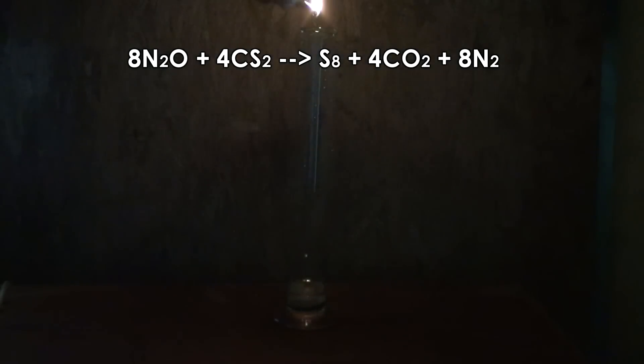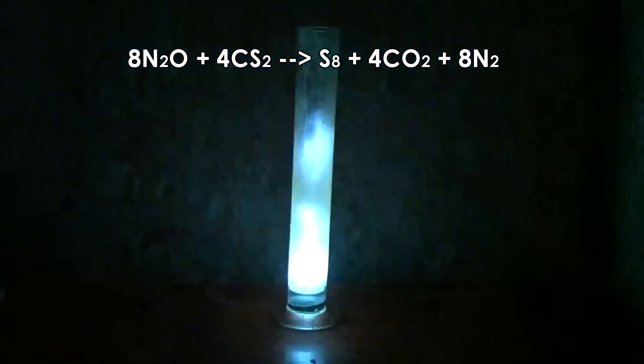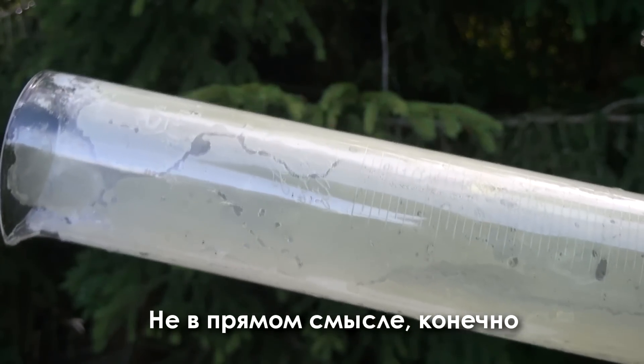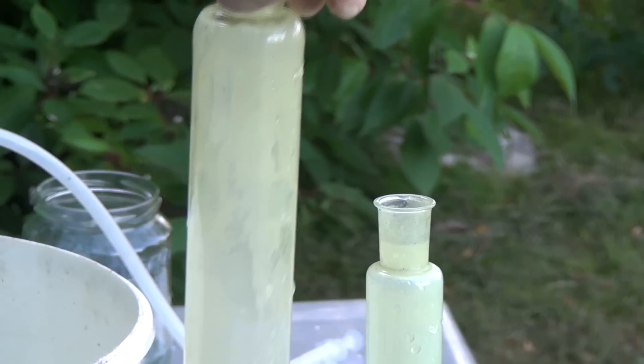The equation of this reaction is carbon disulfide reacts with nitric oxide which releases carbon dioxide, nitrogen and sulfur which is then deposited on the walls of the cylinder and which is very inconvenient to wash off.